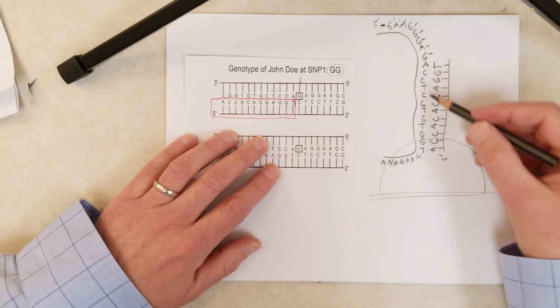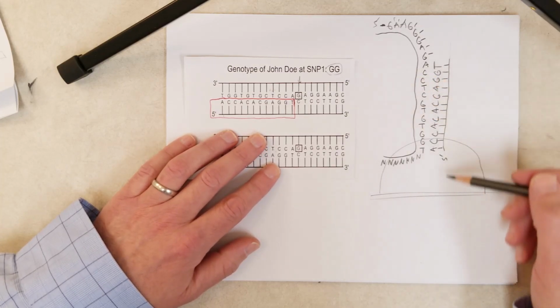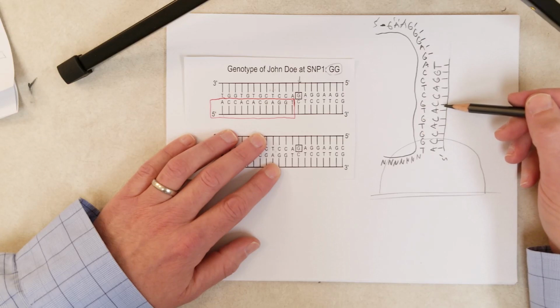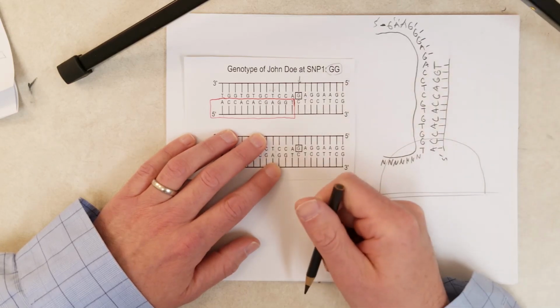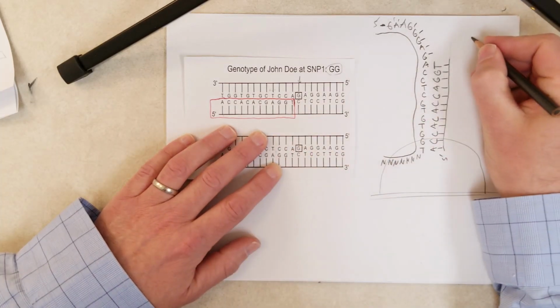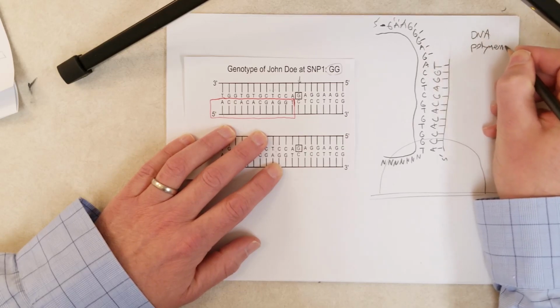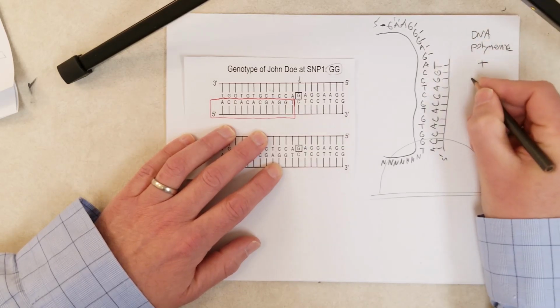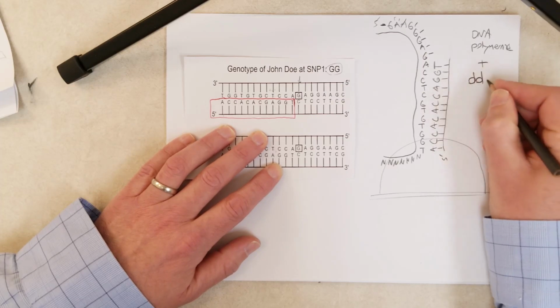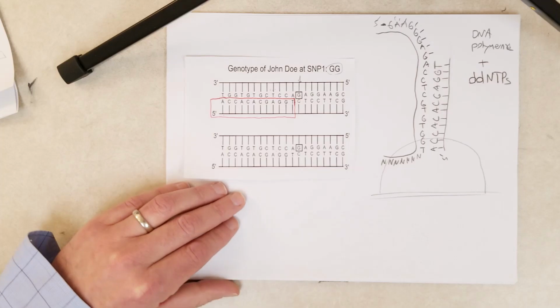So once you let all these little pieces of John's genome attach to the SDOs, and remember there are 1 million different beads, each one with a different oligonucleotide, or different SDO, attached to the bead. Let them all anneal, and then the next step is to add DNA polymerase and these things called ddNTPs. Now, what are ddNTPs? Okay, so that might be kind of confusing.